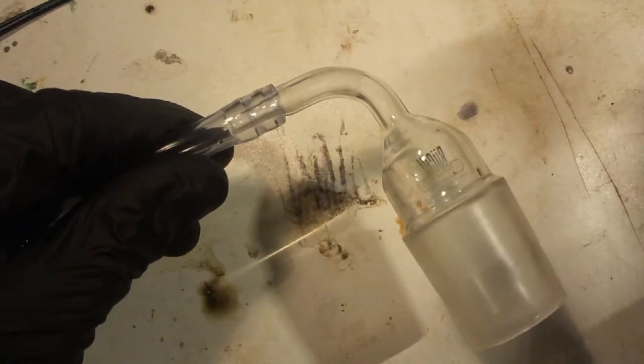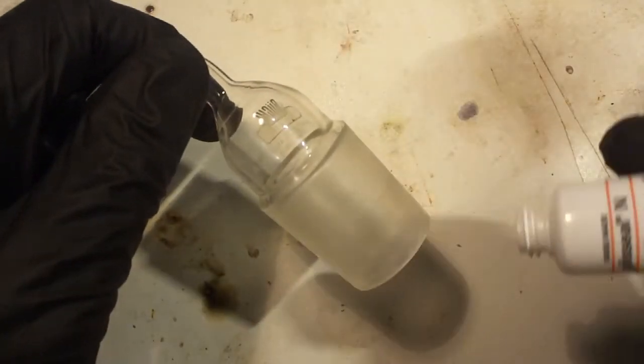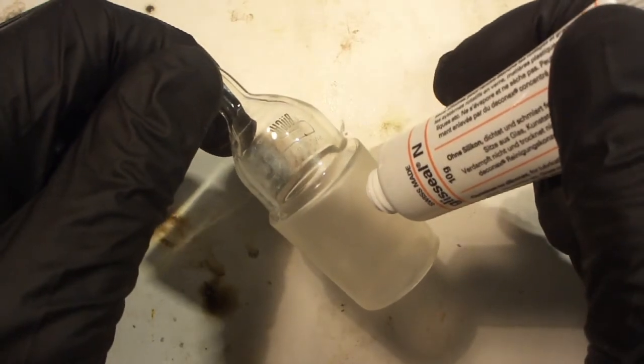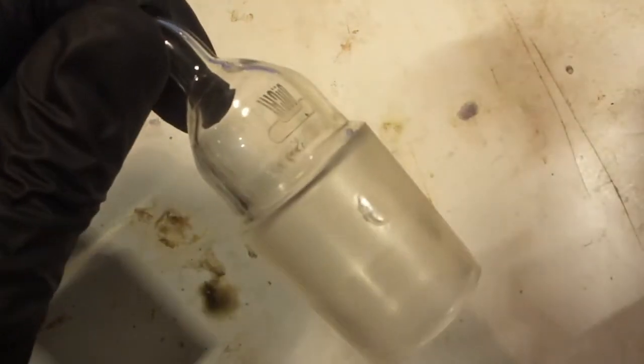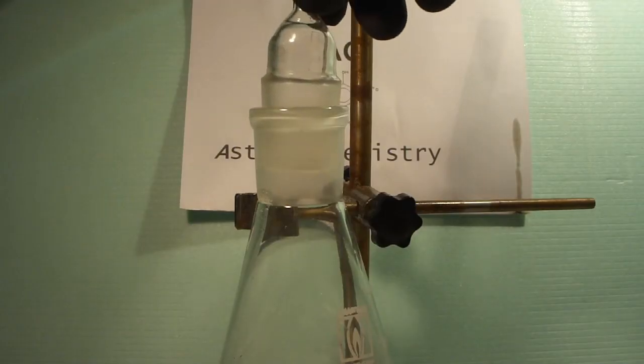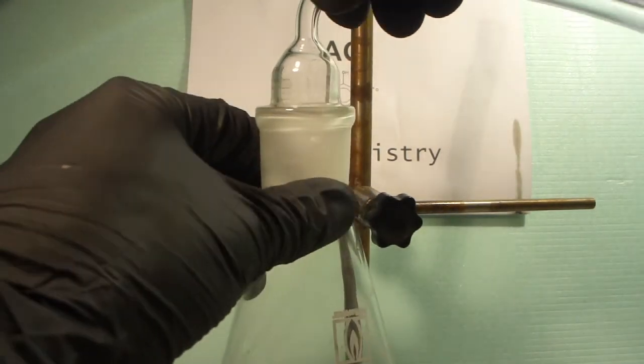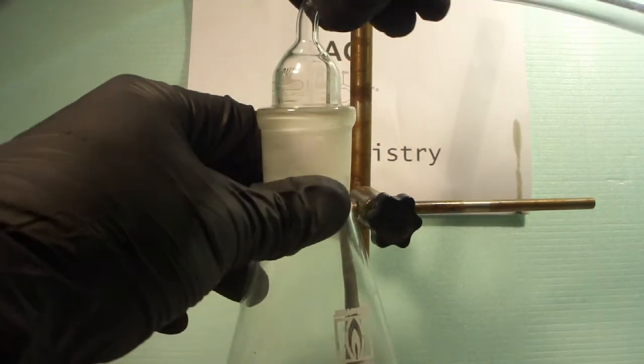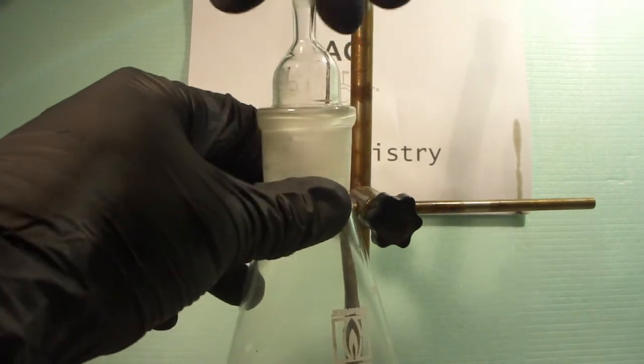Then, grease the gas takeoff adapter with a small amount of lamp grease. Equip this adapter with a flexible tube which is connected to a glass tube on the other side. Secure the adapter with a Keck clip.